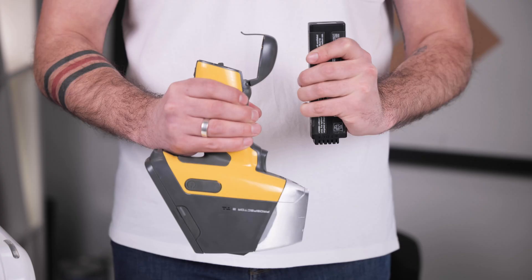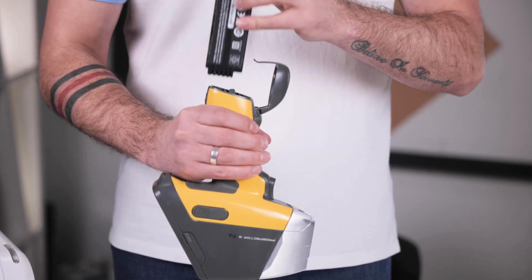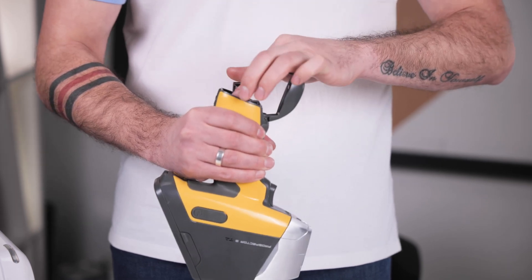A significant but often overlooked mistake is tampering with the warranty label on the analyzer. Doing so can lead to the loss of warranty coverage and may result in expensive repair costs. It is also critical to monitor the battery charge on handheld analyzers. A fully discharged battery can cause damage to itself and negatively affect its function.